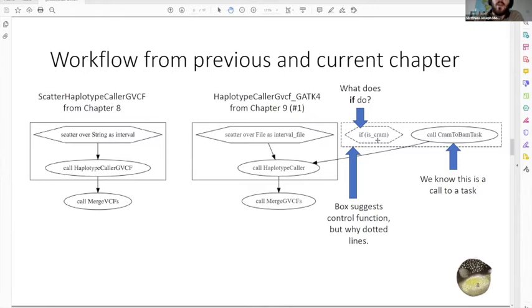And if you remember from one of the earlier chapters, CRAM was essentially a more compressed version of a SAM file. Traditionally we have a SAM file, and then the binary version of that SAM file, which is compressed, is a binary SAM file, which is a BAM file. But there's also another level of compression that was created more recently, using the reference as a key to do that compression, and that file has been jokingly named CRAM.